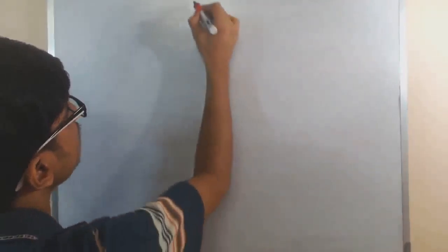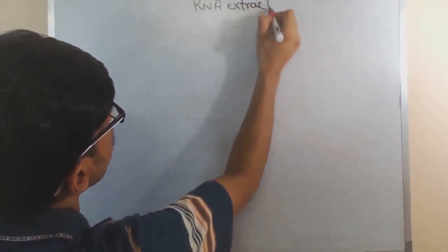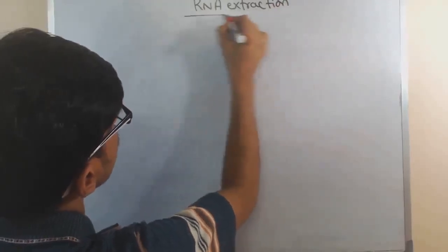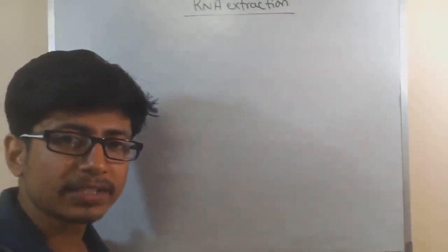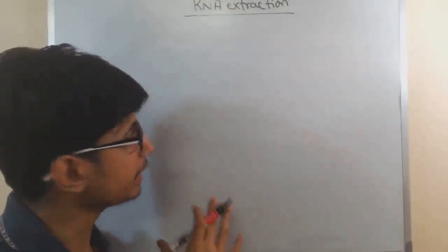Hello friends, in this video tutorial we'll be talking about RNA extraction. RNA extraction is also known as another chemical form of extraction that I will be writing here.